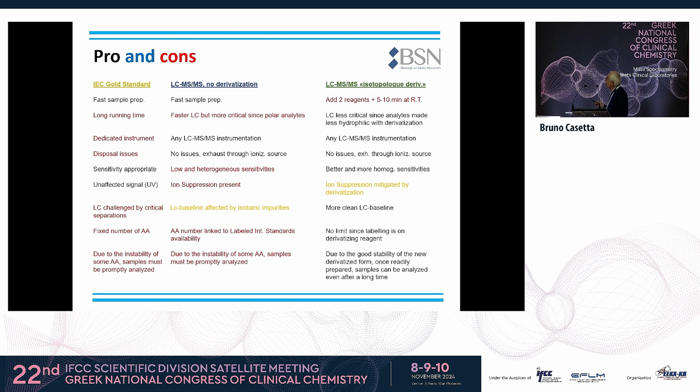Here, we have experienced the good stability of this new derivatization form. We can collect the sample, do the derivatization, and afterwards leave the extract for 4 months in the fridge or in the autosampler, as we have done, and be able to read it afterwards.